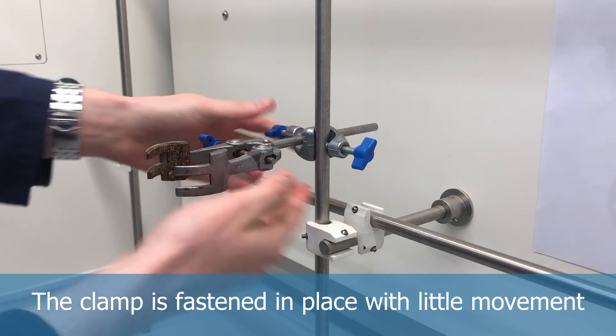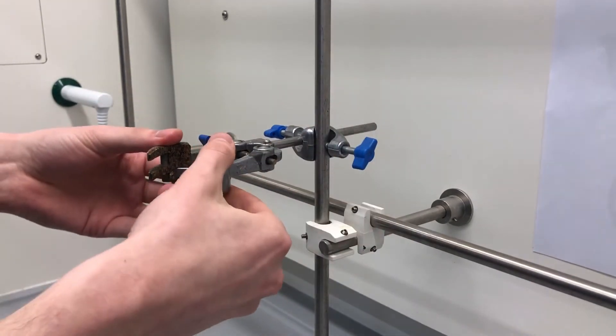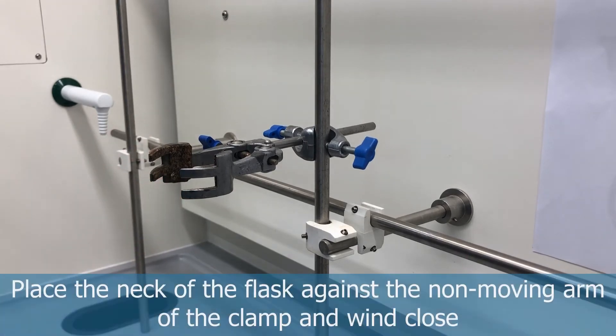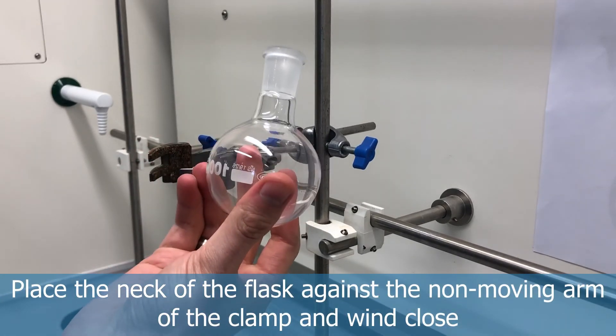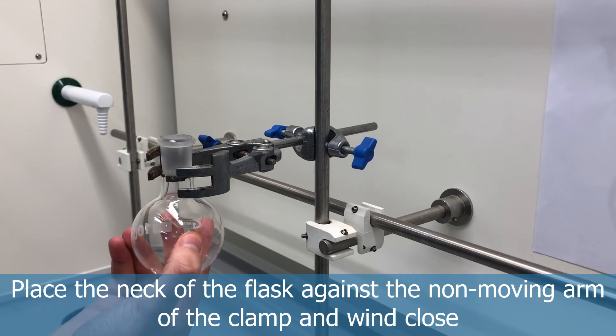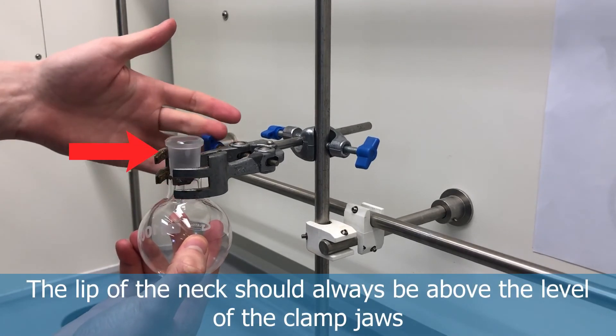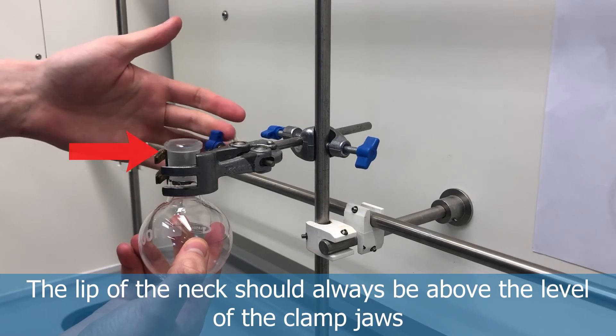When clamping the round bottom flask, hold it against the non-moving part of the clamp. One jaw will move as you tighten it closer to the glassware. Make sure that the lip of the glassware is always above the level of the clamp jaws.